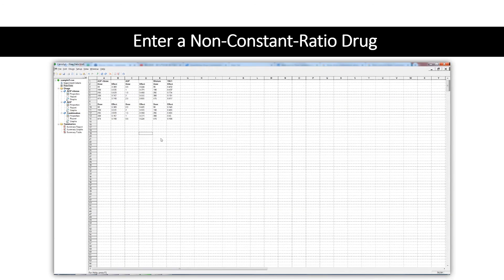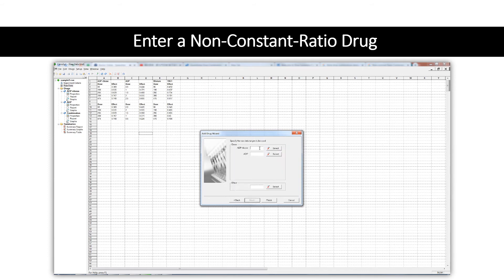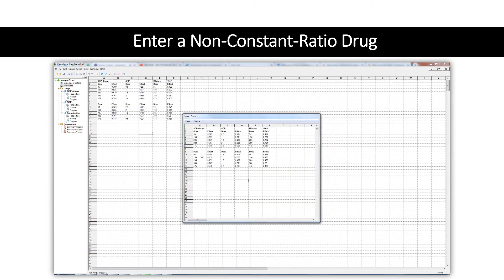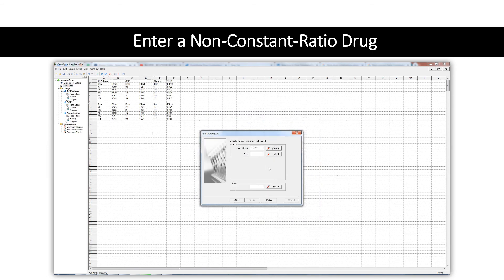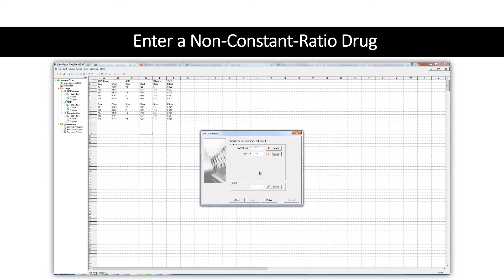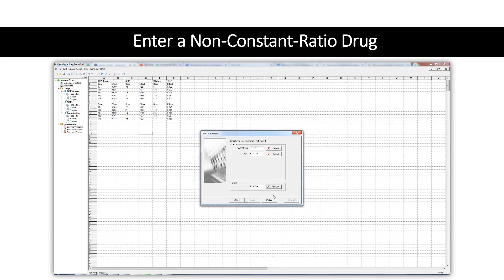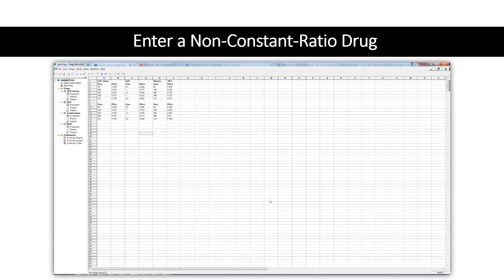To enter a non-constant ratio combination drug, follow the procedure for entering a combination drug. In both the wizard and manual entry, untick the constant ratio box. You will then be required to enter the dose data for all drugs in your combination. You can only enter non-constant ratio combinations containing up to six drugs using the wizard. For combinations containing more than six drugs, you can create the individual drugs using the wizard, but you will need to create the combination using manual entry.